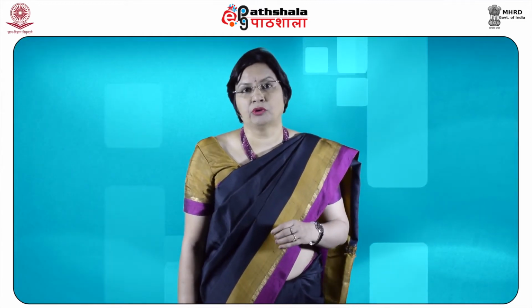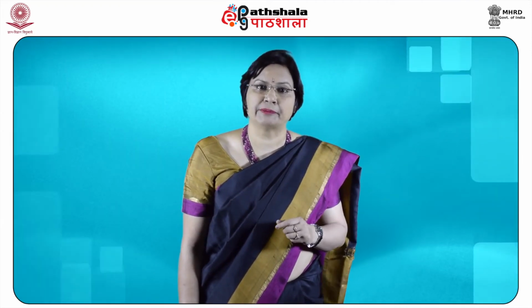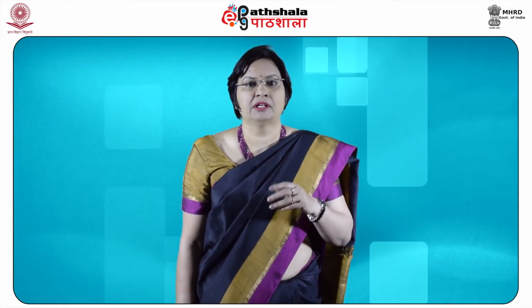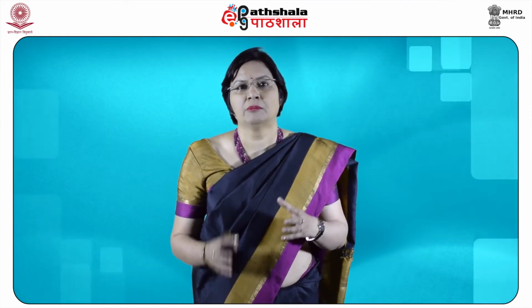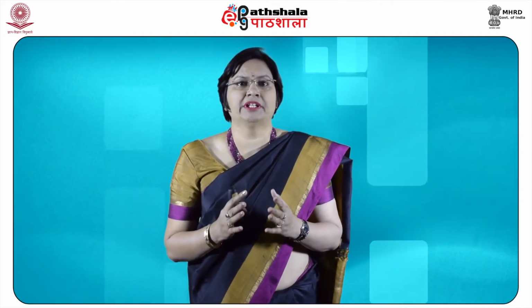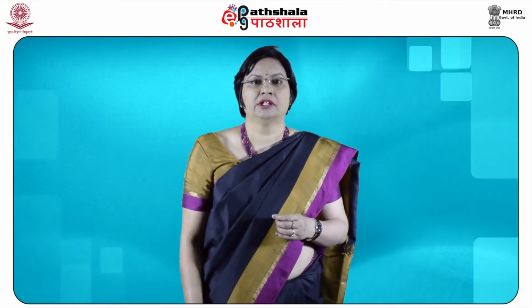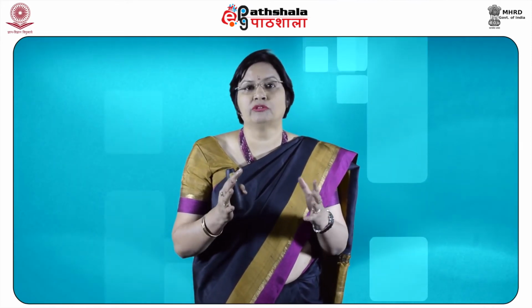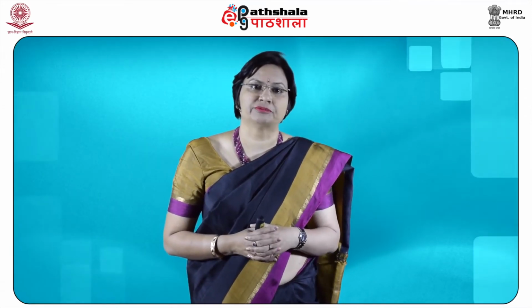After understanding the proton NMR spectroscopy, we shall try to understand the 13C NMR spectroscopy. How the resolution and multiplicity of 13C NMR, off-resonance decoupling, noise decoupling, the broadband proton decoupling, and then based on this the structural application of the 13C NMR, and then we will also see how the DEPT and the introduction to 2D NMR techniques, which will also further simplify and help us in making the structural elucidation.